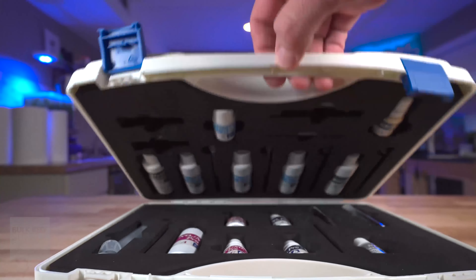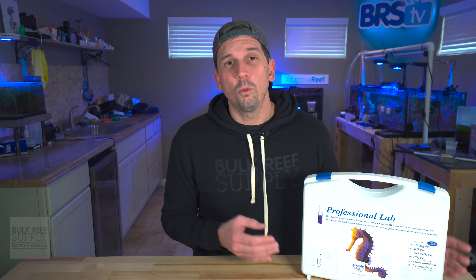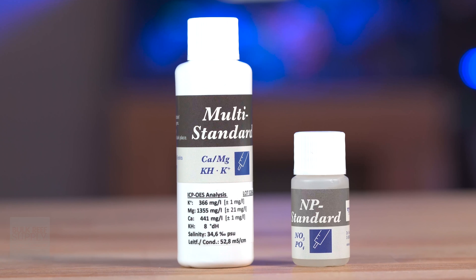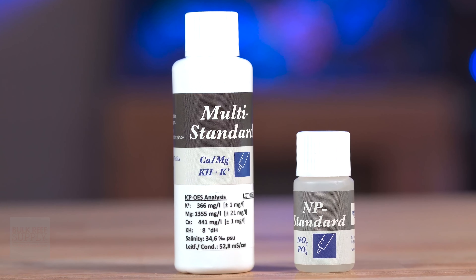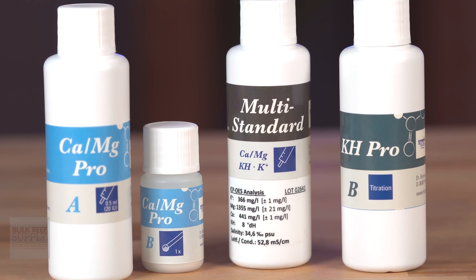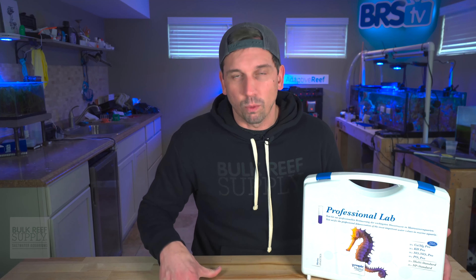The most important thing to consider is having all of these test kits in one place, so not only do you perform these tests, but you actually want to perform these tests. Reference solutions for multi-standard and NP standard are included, and these will allow you to test the validity of the reagents you have. The multi-standard tests the validity of calcium, magnesium, and KH, while the NP standard tests the validity of the nitrate and phosphate tests. It's rare when a company offers these reference solutions, especially useful if you're new to titration kits.